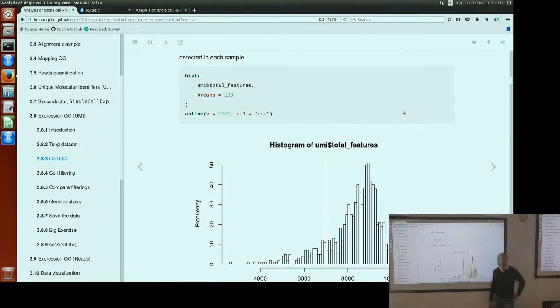Essentially, how do we set the threshold of where to cut it off? Like how did you come up with the 2,500, or on the other end? So the question is how do we set the threshold? Here we set the threshold manually by looking at the histogram. Yes, it's completely subjective, and we think there is no other way to do it at this point.